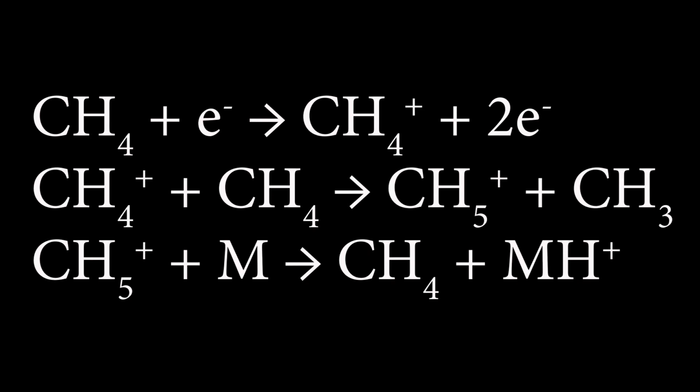It doesn't have to be methane. It can also be isobutane, which is quite common, and this is gentler than EI. But CH5+ still has a lot of energy, so it still does have a bit of a kick to it when it transfers that proton.